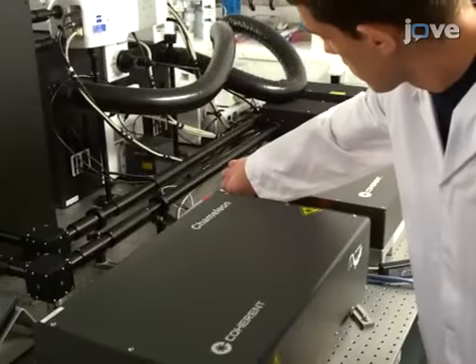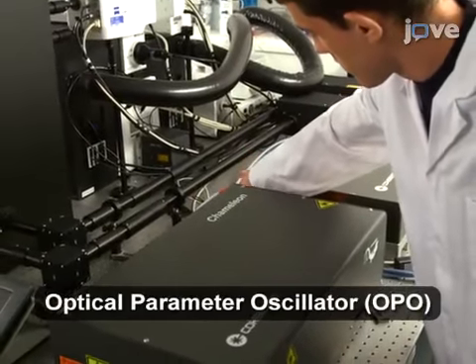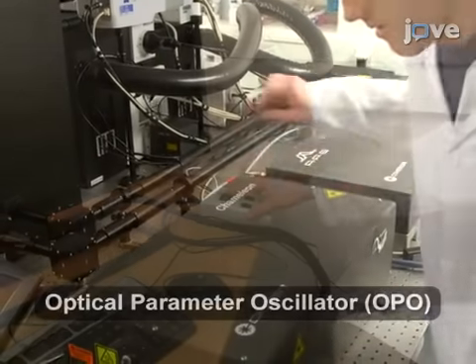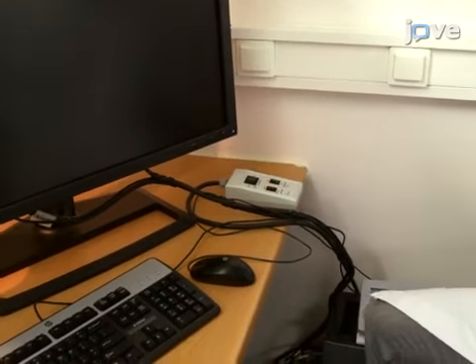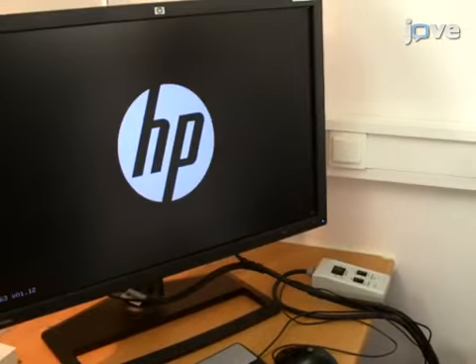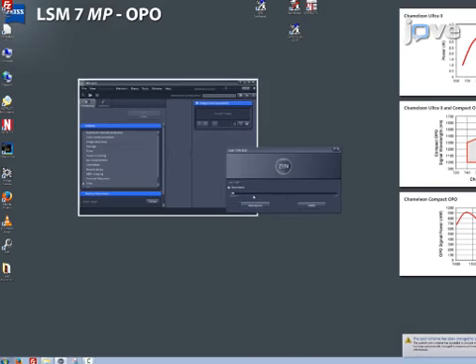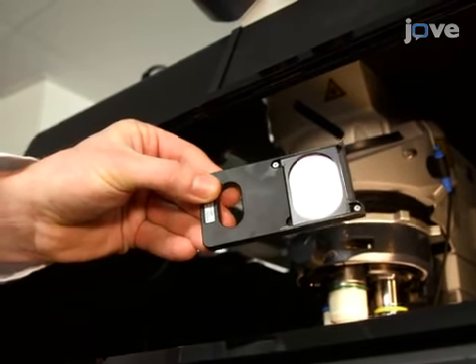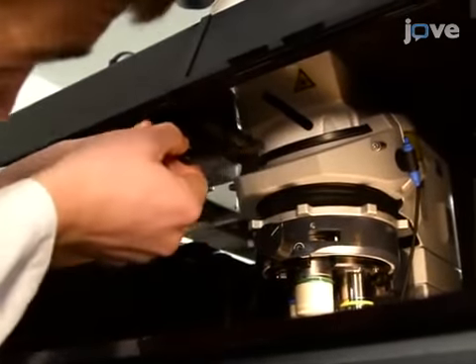Turn on the titanium sapphire and OPO lasers as presented in the text protocol. Switch on the microscope computer, turn on the microscope component switches, and start the software by double-clicking the icon on the desktop. Set it up according to the text protocol, then place a dichroic mirror with a cutoff wavelength at 760 nanometers in the side port slider located in the infinity space above the objective nosepiece.